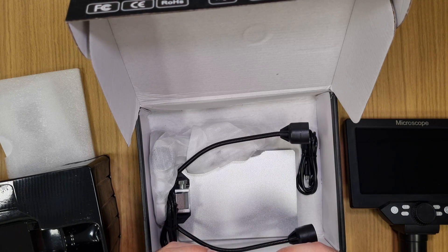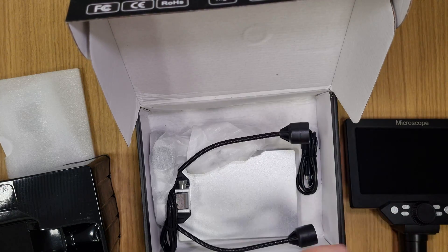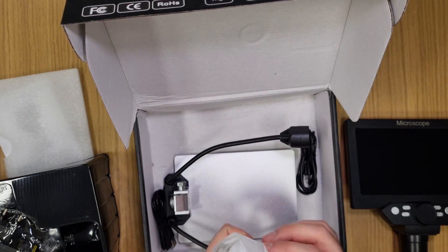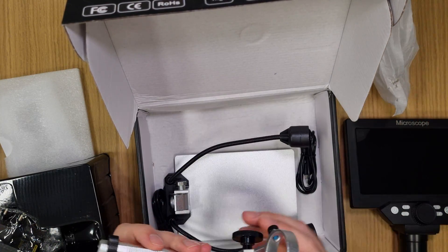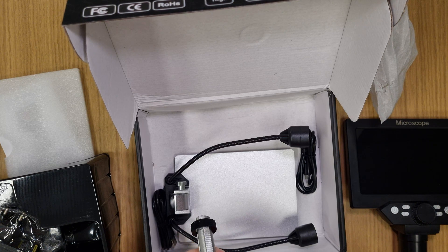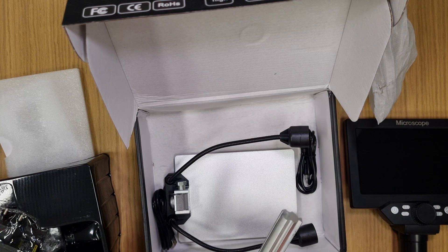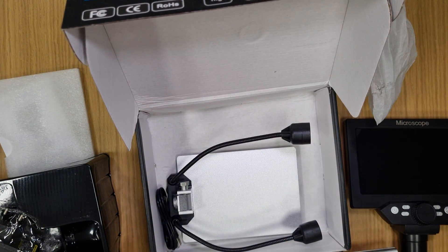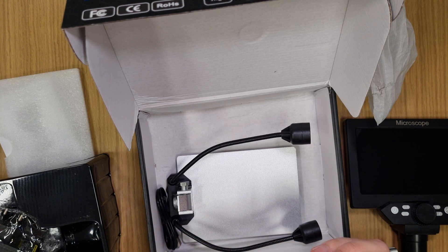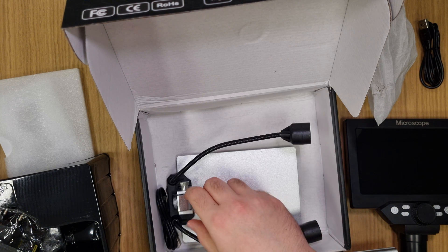We've also got a power supply — five volts, two amps — I'm a bit afraid to use it. Then there's an aluminum stand and a USB to micro USB cable, though unfortunately it's micro USB.